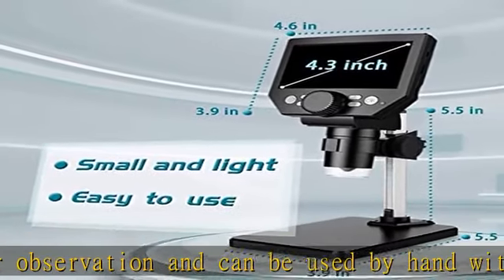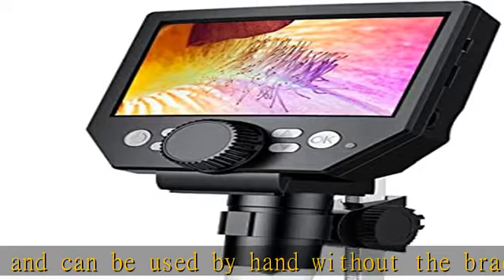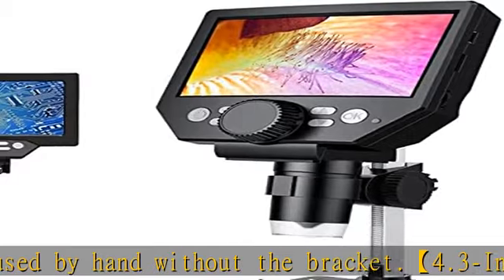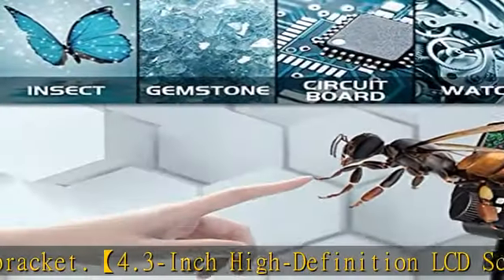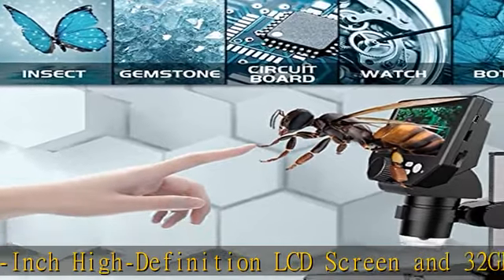The focus function is easy to adjust. Move the object close to the lens and then slowly rotate the focus wheel to clearly view the sample on the 4.3 inch screen. The attached metal bracket can be used for stable shooting.